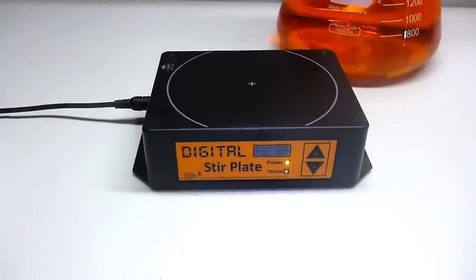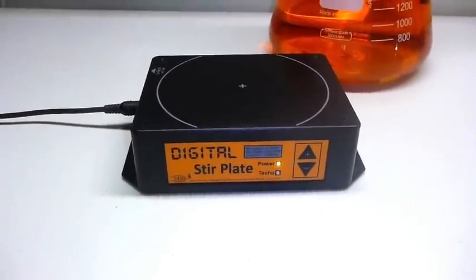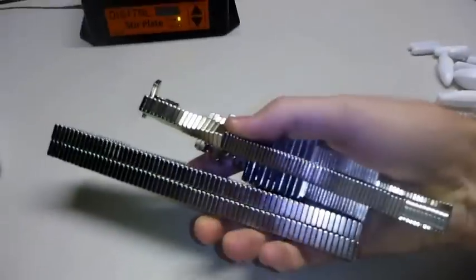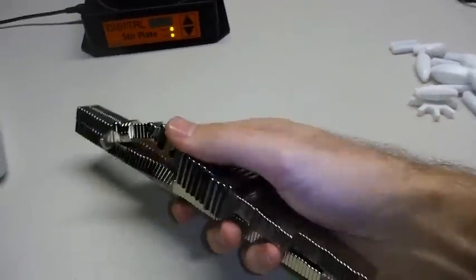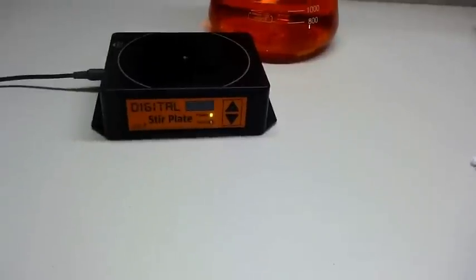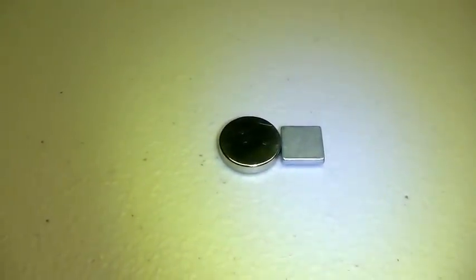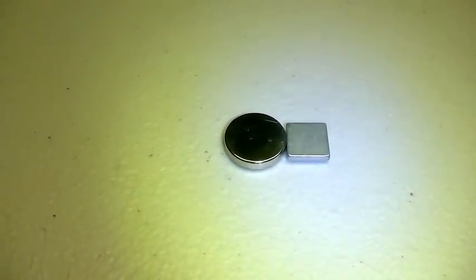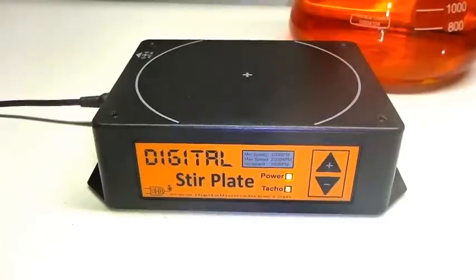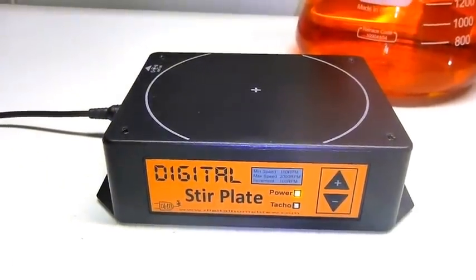Another thing we changed for this release is the magnets used inside — this time we've gone with slightly larger magnets. We did a lot of testing with a whole brick of neodymium magnets in all different shapes and sizes, and in the end we chose this round one here. It's slightly larger, and it turns out size wasn't everything though — we tried some really big ones that didn't work very well. But this one has given us a bit more reliability so it holds the stir bar better and allows you to ramp up a lot faster without having to worry about throwing off the stir bar.